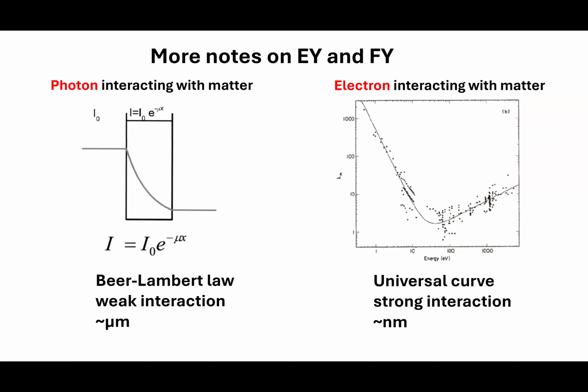Examples include the electron yield of XAS and also XPS, X-ray photoelectron spectroscopy, which is utilizing photoelectrons. Whenever you use electrons, whether electrons or photoelectrons, they have strong interaction with solids. They have a very small escape path. They probe the very surface of this.